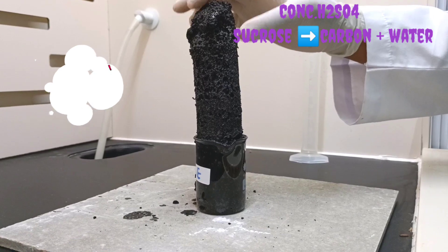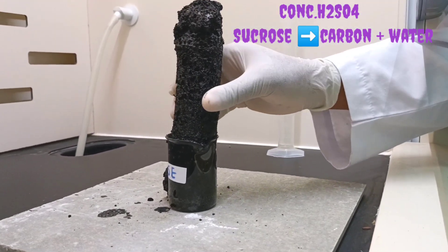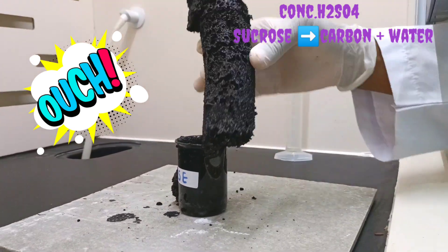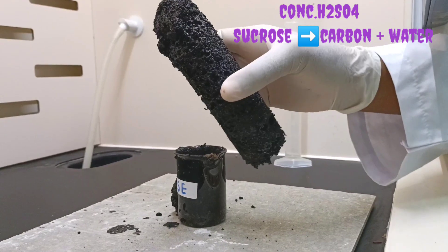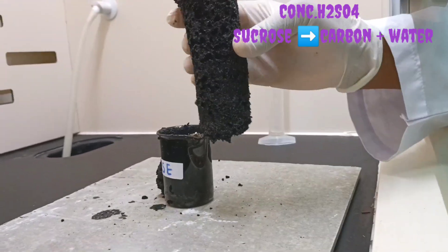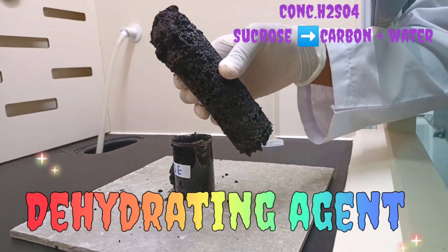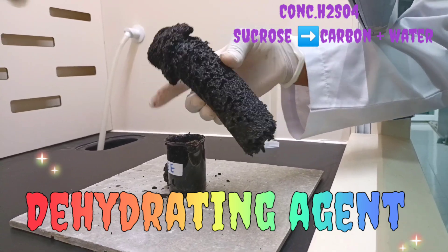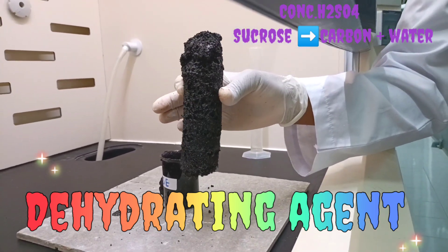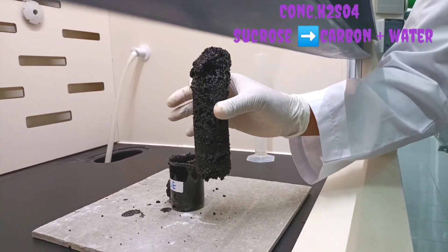This is hot when I cut my carbon snake. You can see it's actually carbon — it looks like charcoal. What happened here is that sulfuric acid acted as a dehydrating agent. A dehydrating agent removes water from a substance, so the concentrated sulfuric acid removed water from my sucrose.